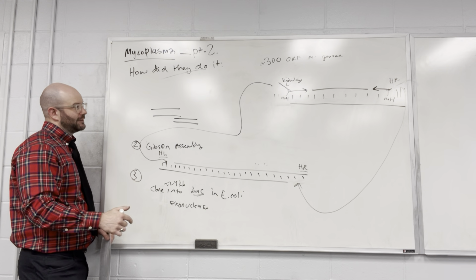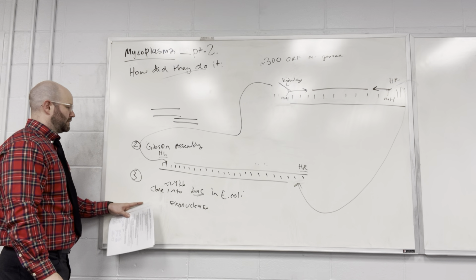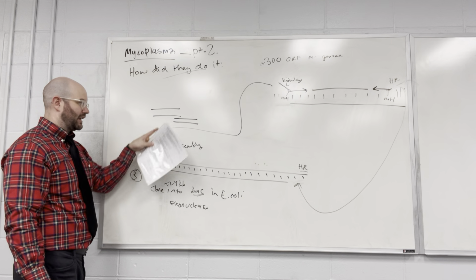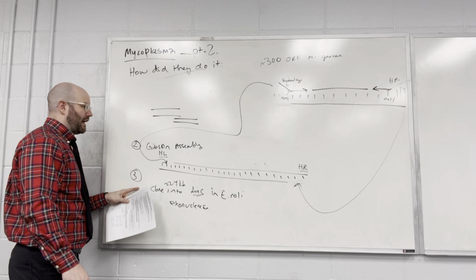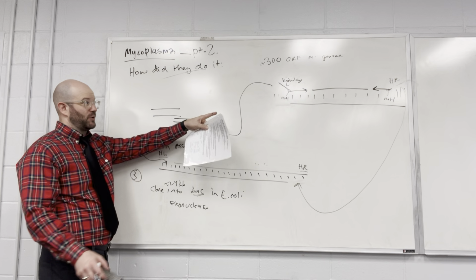Okay, so we understand now how they go from, in step 1, these 7 to 8 kb fragments. We understand how they come together with essentially a Gibson assembly into a 24 kb size plasmid. And then they actually PCR the backbone with special primers.